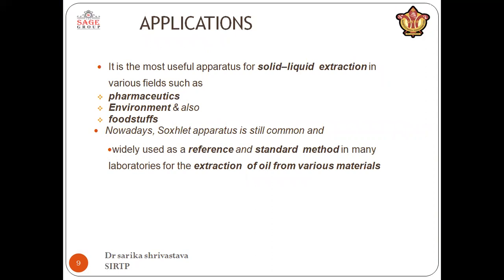Application. It is the most useful apparatus for solid-liquid extraction in various fields such as pharmaceutics, environment, and foodstuff. Nowadays, the Soxhlet apparatus is still common and widely used as a reference and standard method in many laboratories for extraction of oil from various materials.